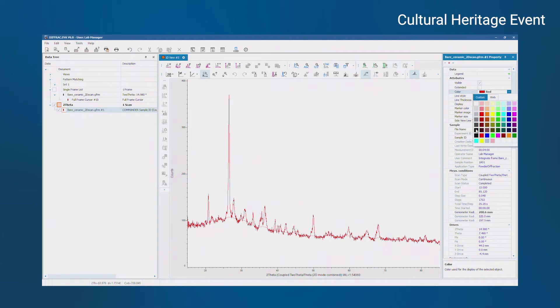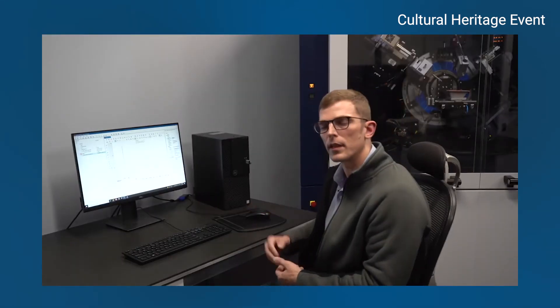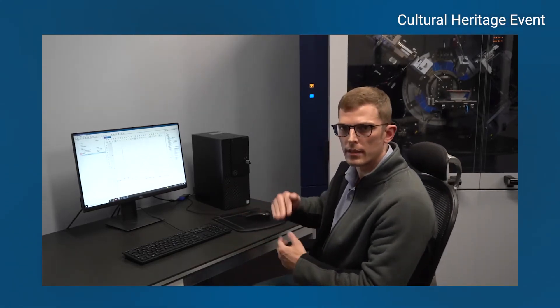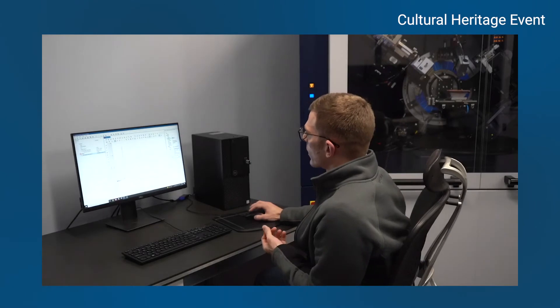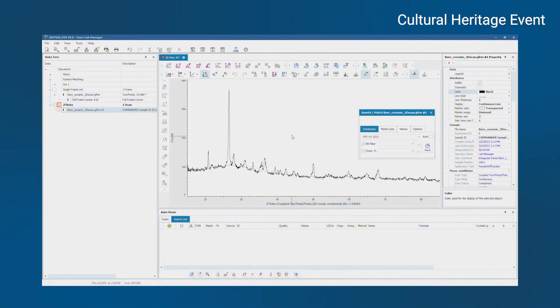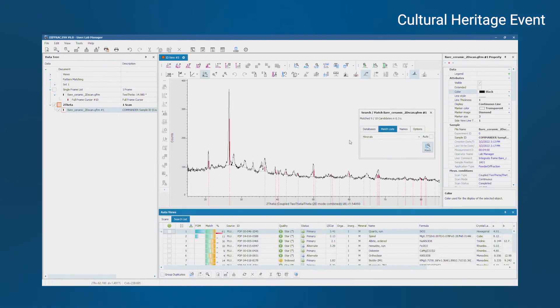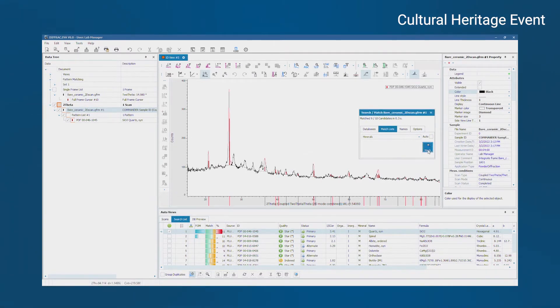Let me make this black so it's a little easier to see. Once you have the integrated data, then there's a tool to identify which crystal phases are present based on the peaks that appear in the peak positions, as well as the peak intensities, the relative intensities. So it's kind of like a fingerprinting technique for different minerals. If I open search match, you can see the biggest peak corresponds to quartz. And then if you want to, you can gray it out and search on the remainder.